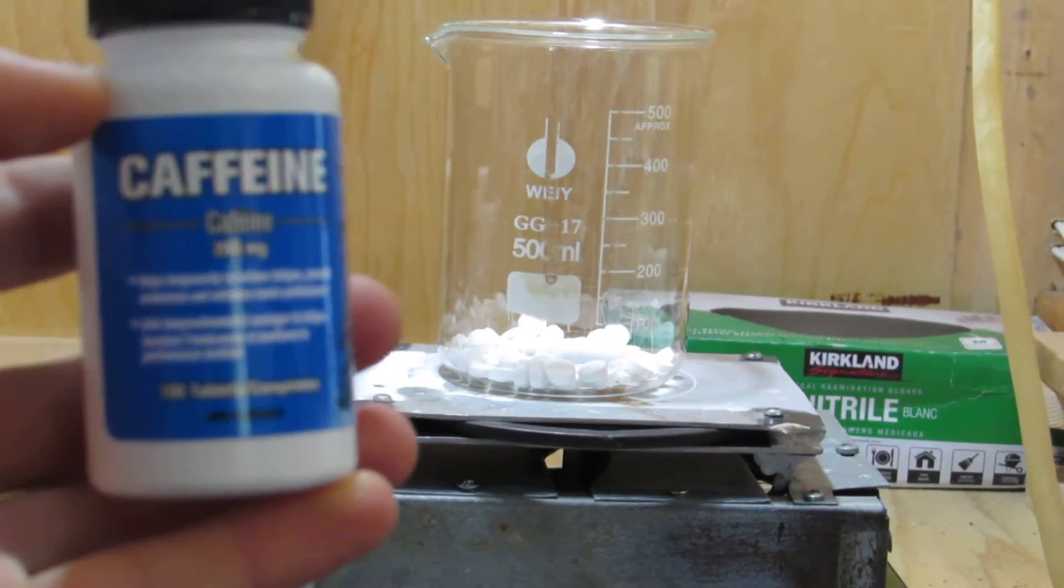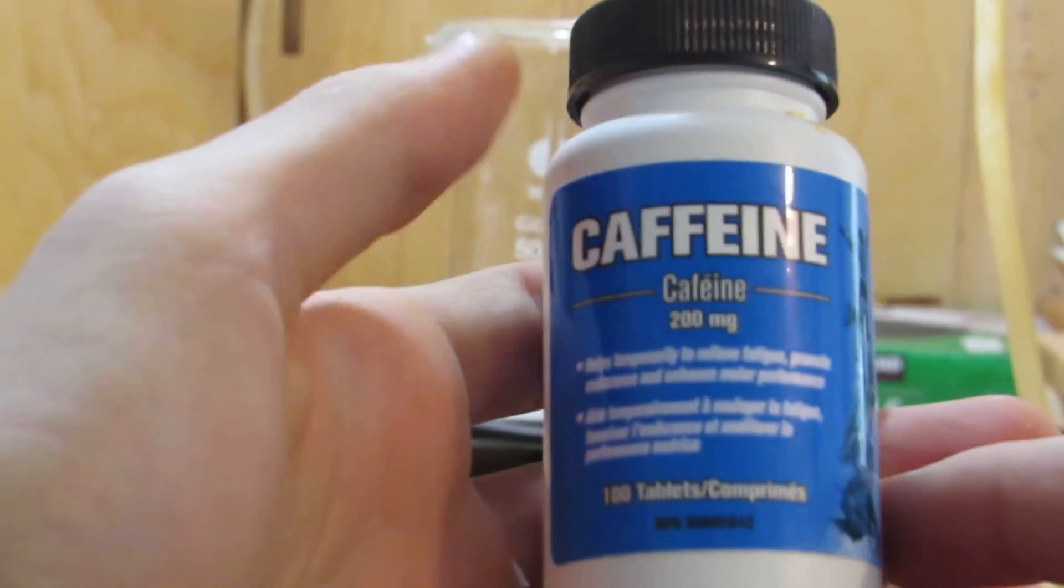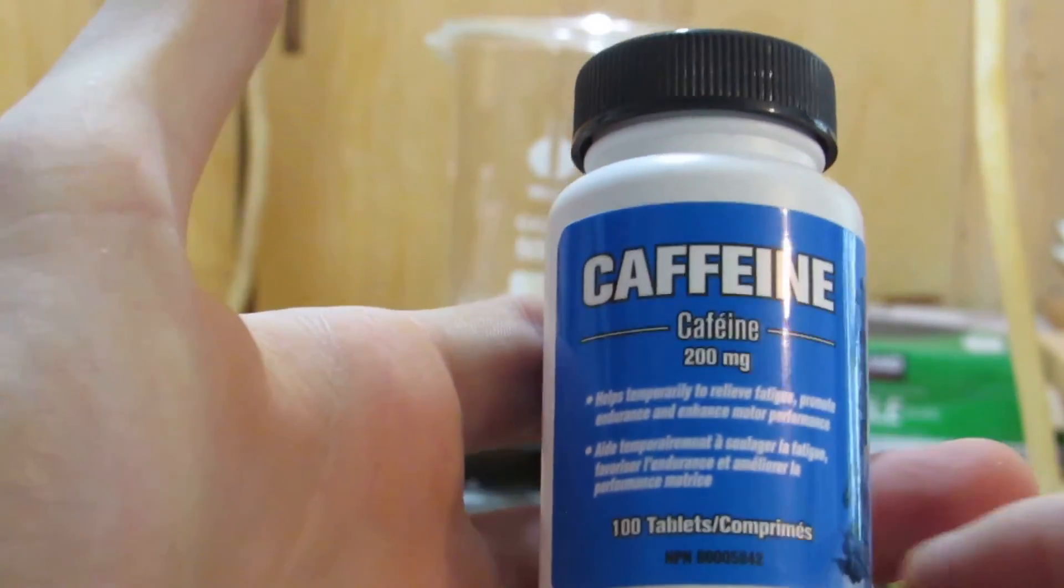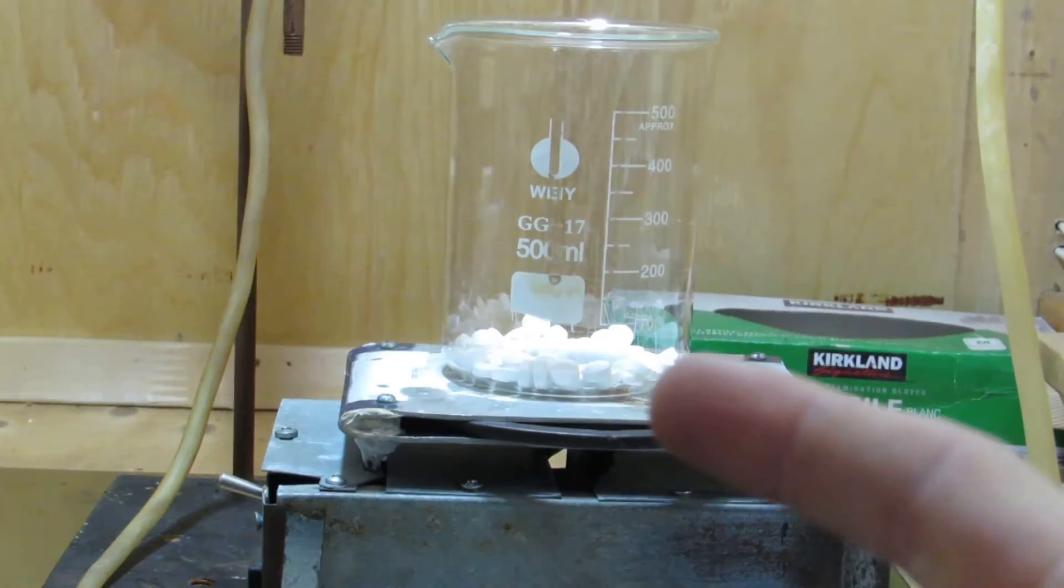Hey guys, welcome back to another video. Today we'll be quickly extracting some pure caffeine from caffeine pills. 100 caffeine pills can be purchased for around ten dollars, and each pill contains 200 milligrams of caffeine, so these are a very cheap source of caffeine.